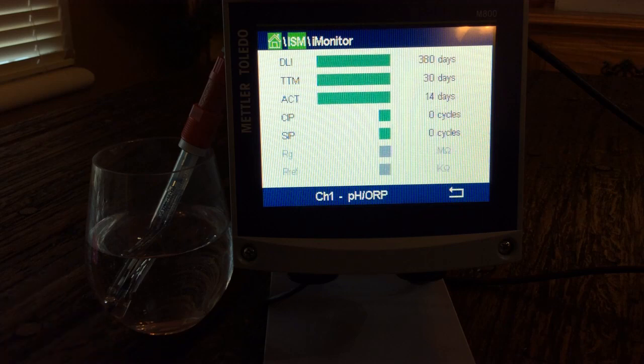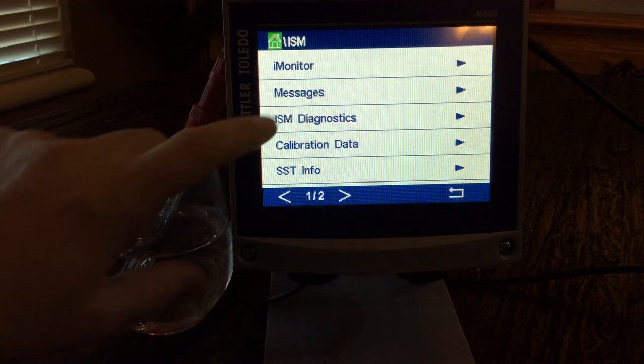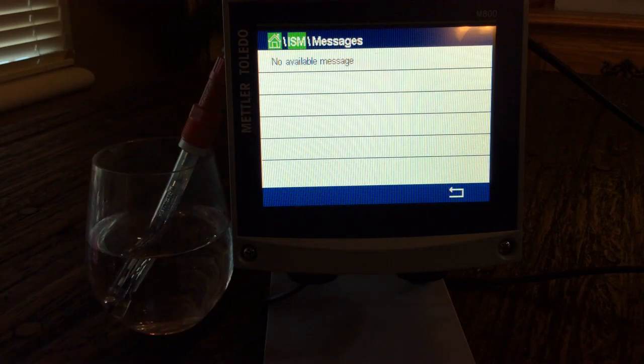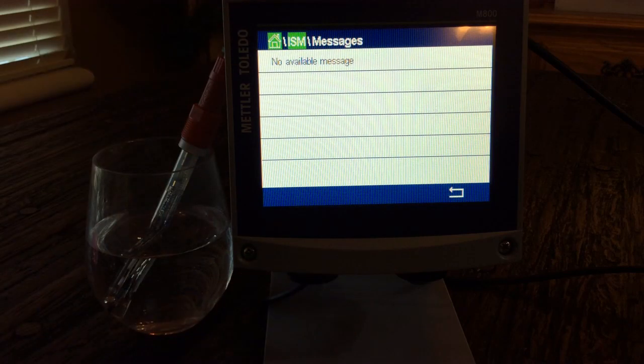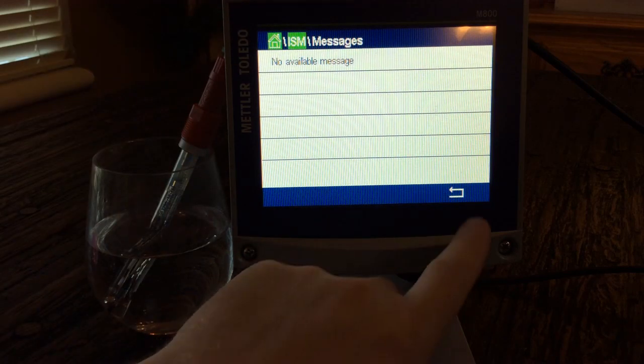With this being a color screen monitor, those indicators will be in green, yellow, or red. Under Messages, if you ever have any error messages, that's where they would come up. You would know because the blue indicator would be flashing red, and you can see what those messages were.